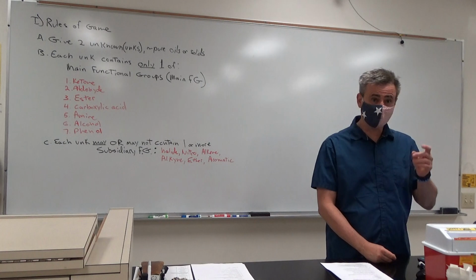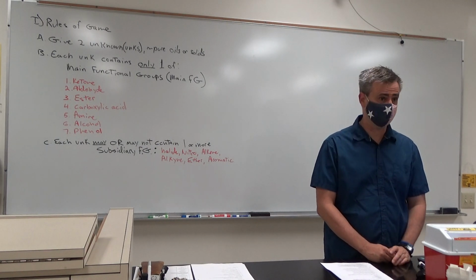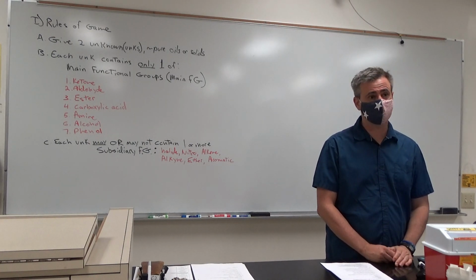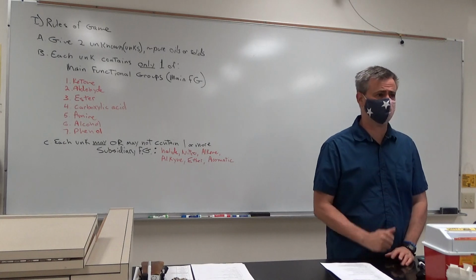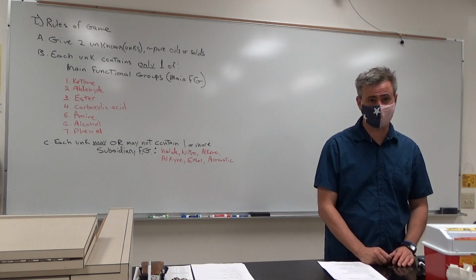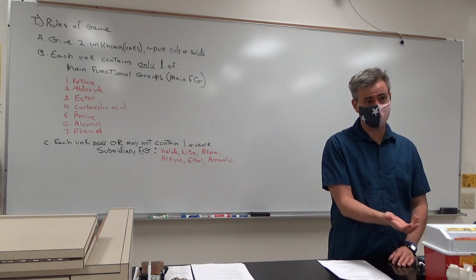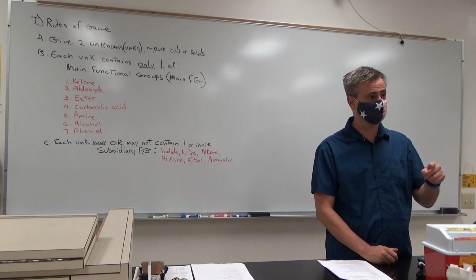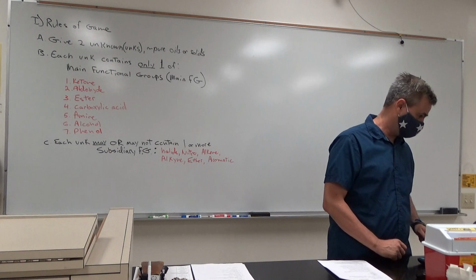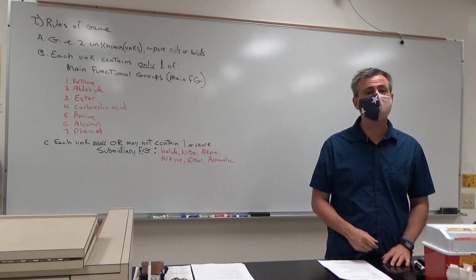If it's not soluble, then you want to heat it a bit. Definitely heat it and stir it. Sugar is extremely soluble in water, but if you dump it into your coffee and don't stir or heat it, it's just going to sit at the bottom, even though it's highly soluble. Some things will eventually dissolve, but it's going to take hours unless you stir it.